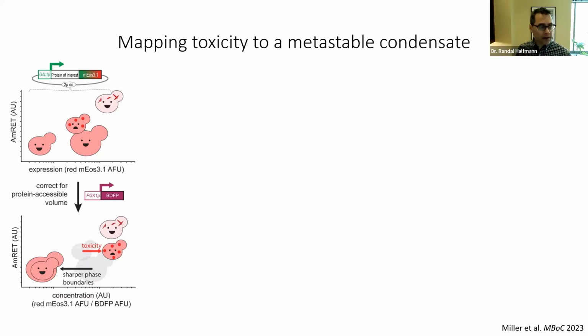They shift right. And when we thought about it, of course, that indicates that because our proxy for protein expression is in the denominator here, in those cells protein expression has been turned down, right? So it's inhibited. And that's actually one of the first and global things that happens in a stress response. When there's some proteotoxicity or other stress, protein translation is dampened. And we're actually now reporting on that. That gives us a way to see which states or which populations on our DAmFRET plot are causing toxicity.